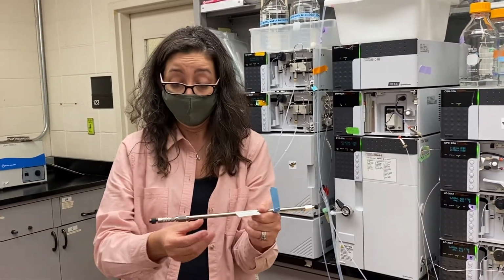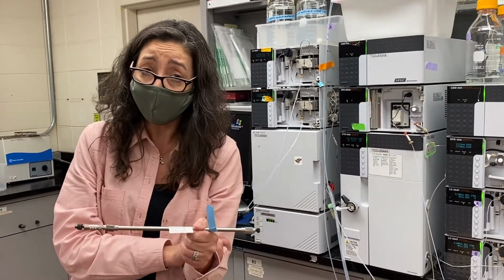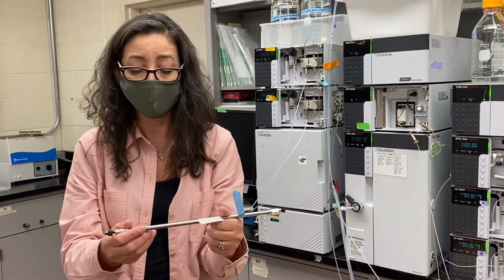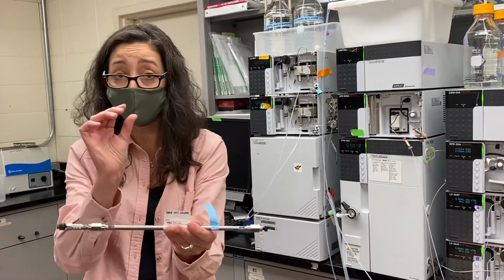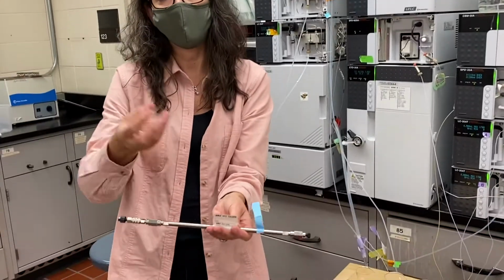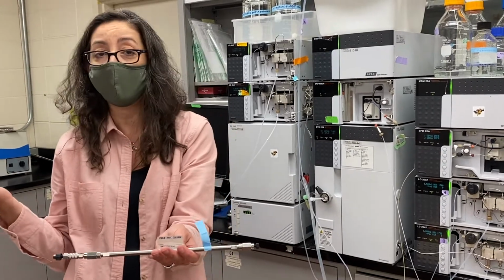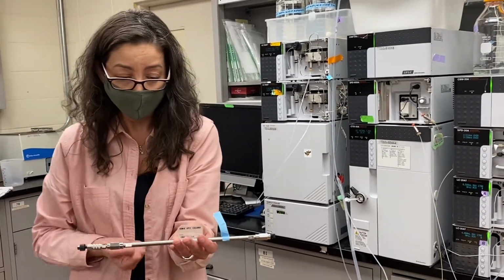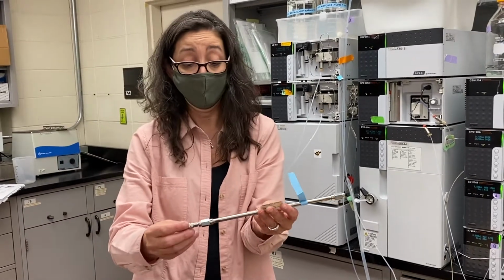So in HPLC, which you will learn is different than GC, the column in HPLC is made from stainless steel and it is packed at high pressure. If we drop it, the stationary phase will break, and then we have to throw away an $800 to $2,000 column. So you don't want to drop my column, please.